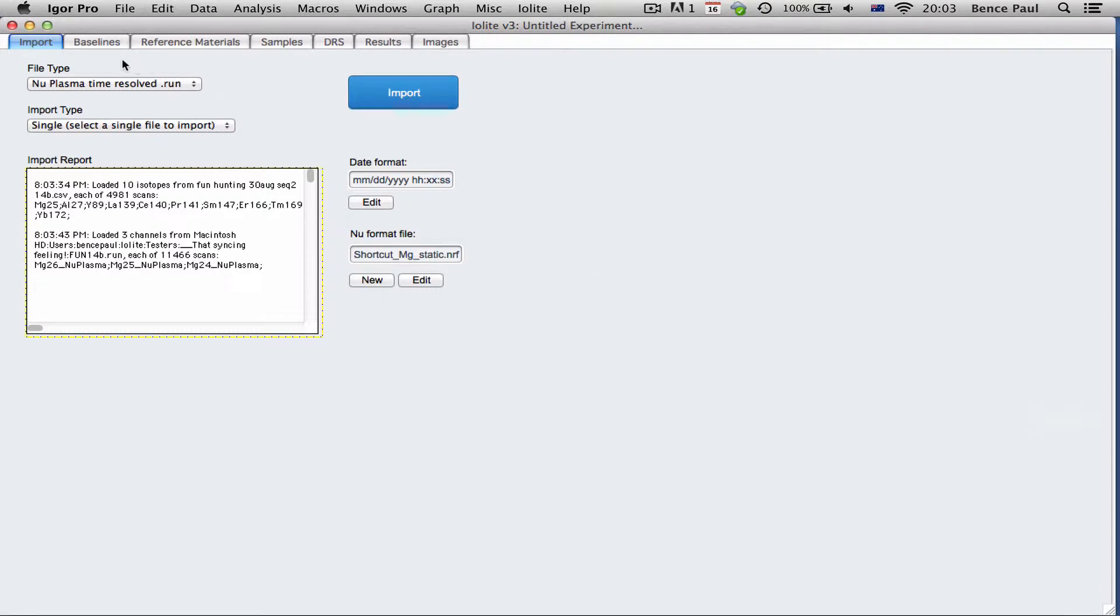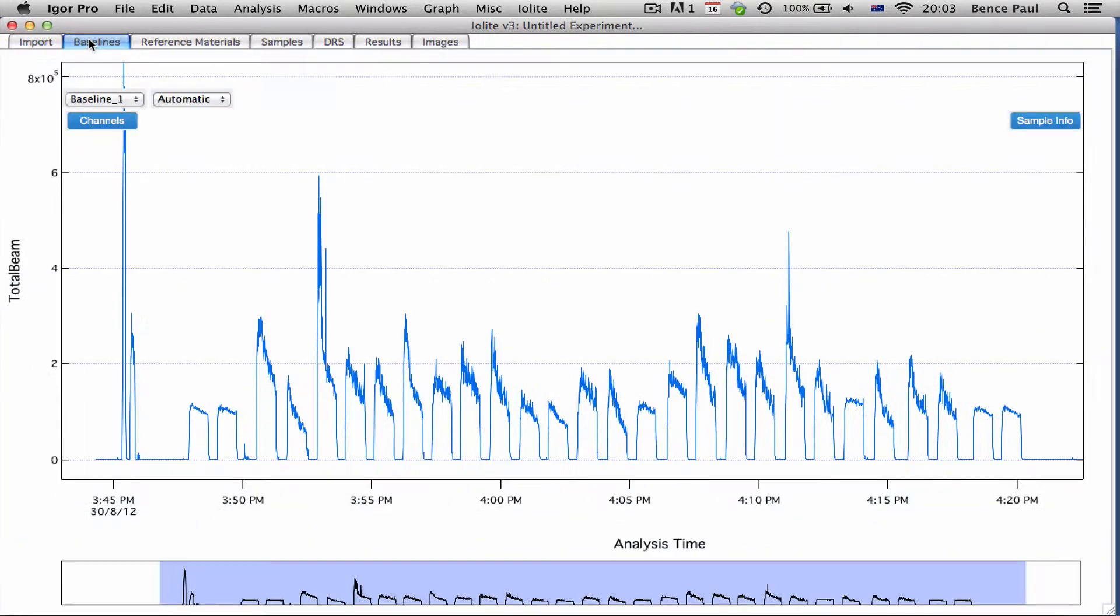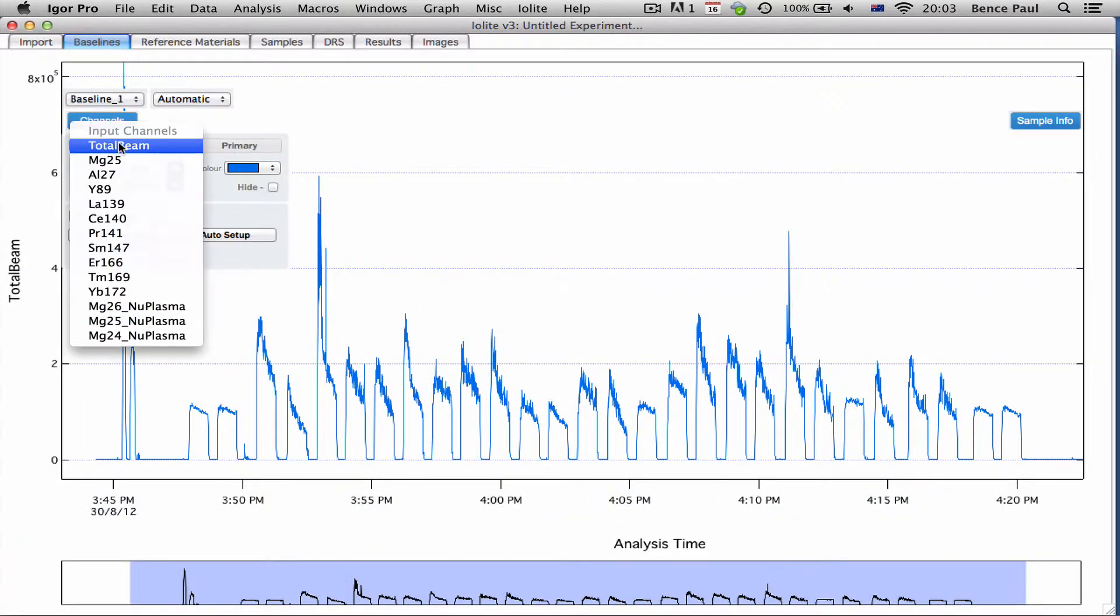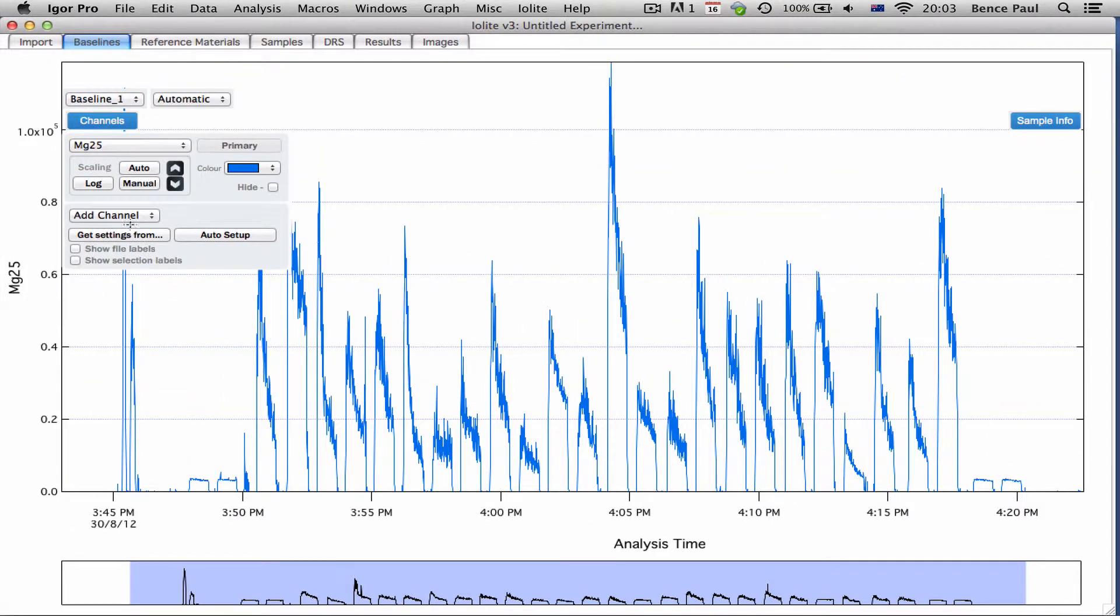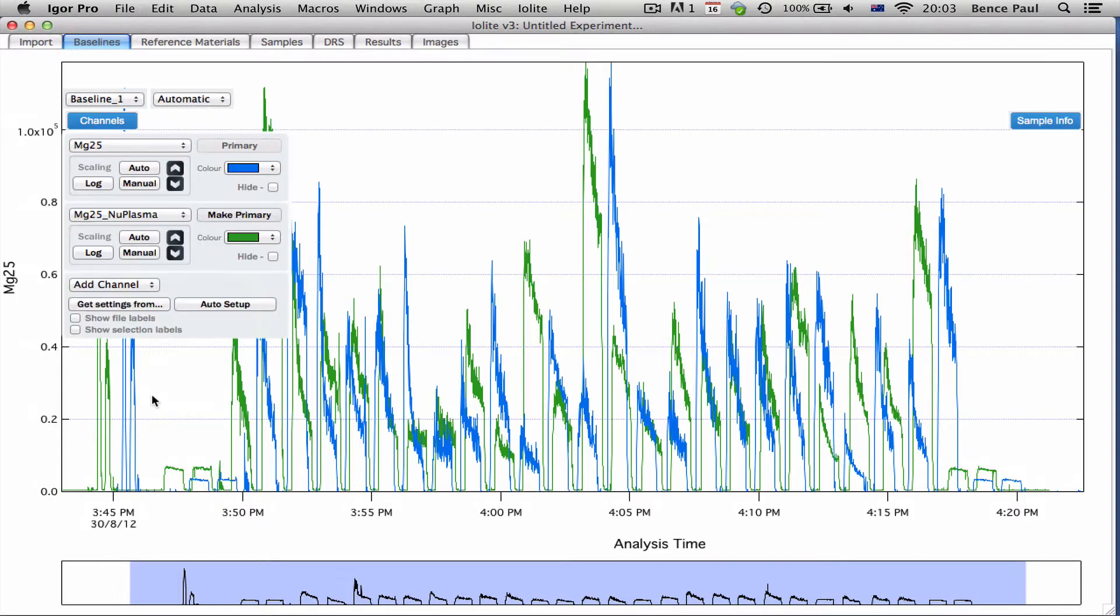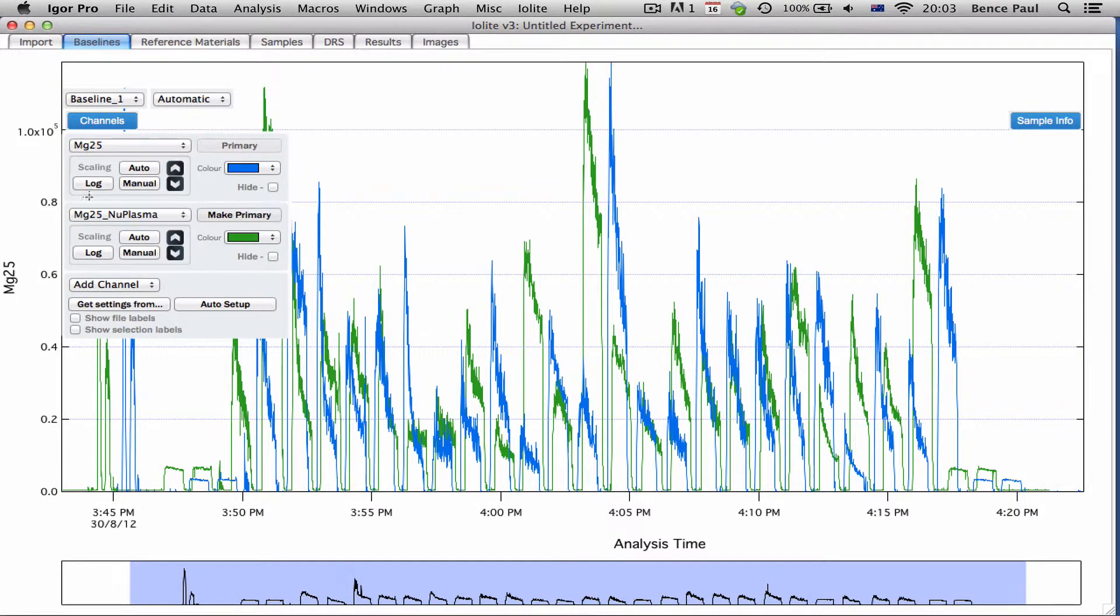You can see both of those are loaded, and if we look at channels that are common to both data sets, magnesium in this case, if we look at magnesium 25 from the Agilent and from the new plasma machine.